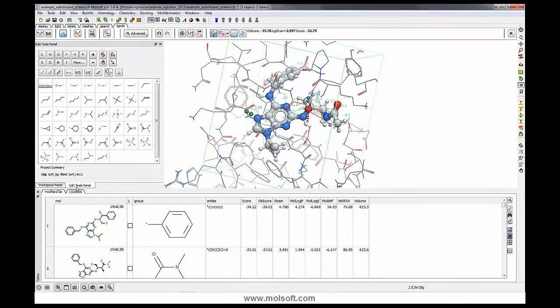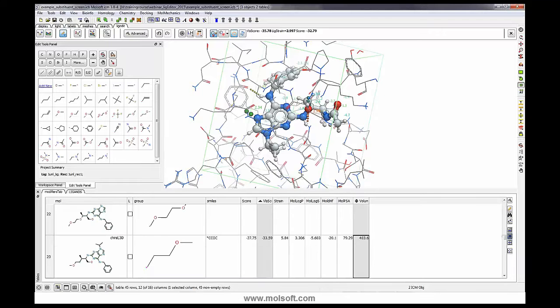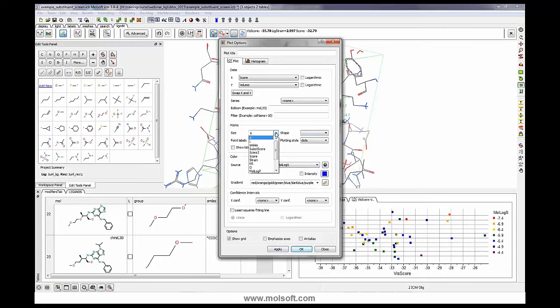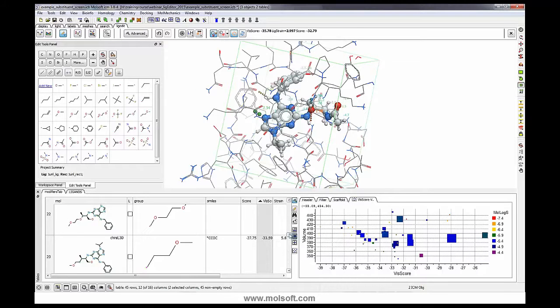So these are the editing tools, and this is a table that you can sort by score here. I'm just using the sort button here. It's also a chemical spreadsheet, so you can make plots of things, as we showed last week or a couple of weeks ago, like this. So yeah, it's fully interactive. So you can evaluate which substituents are useful and which are not.